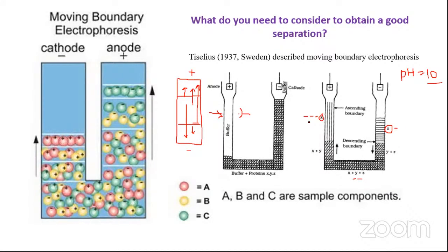So can I not do this? Can I not ensure that every protein molecule which is migrating should migrate towards only one end of the electrophoretic cell, so that I essentially get migration only in one direction? So I'm minimizing the opposite flow of ions that can generate a great amount of heat. Can I not do this? Yes, sir. Right? So that is got rid of. So you can adjust the pH, fine.